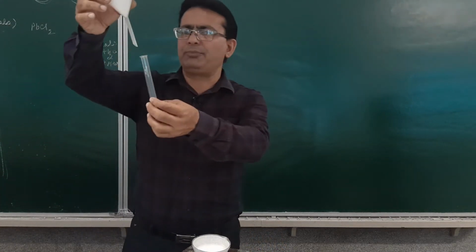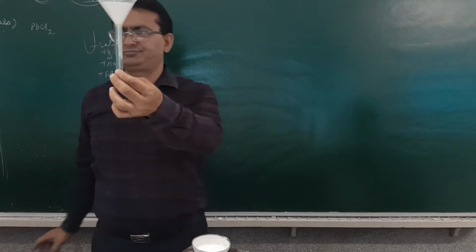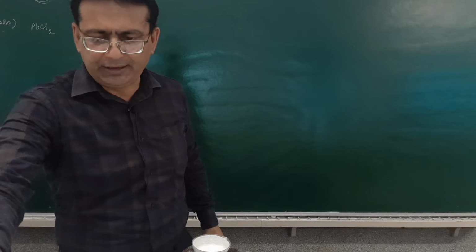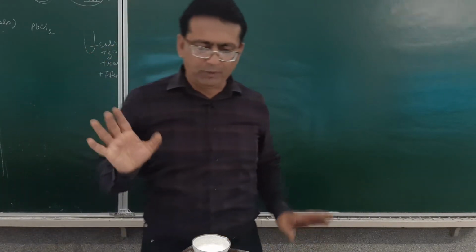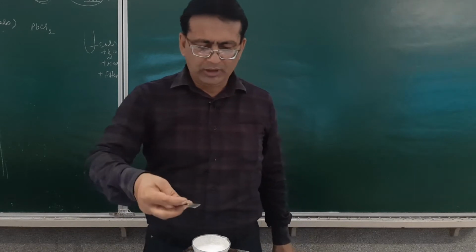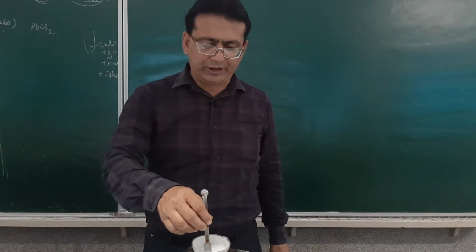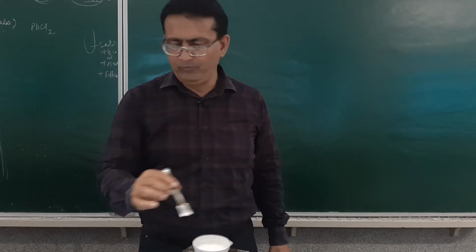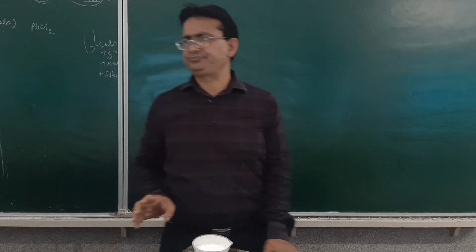I'll put this setup in a test tube like this. Am I clear or not? Then filter it when I find it has been properly heated up. You have to be very careful so that you do not get burned.